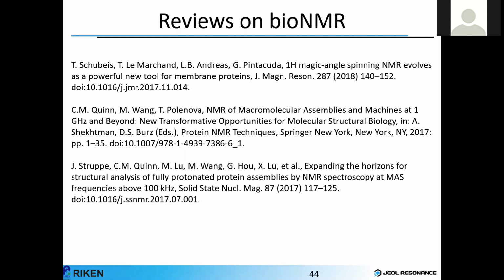And already when you get to 80% of the speed of sound, you start getting shock waves, and these are unpredictable shock waves. So if you convert your angular frequencies into linear velocities, what you find is that most of these fast spinning rotors are at about 250 to 260. I think the one from Agilent is about 267 meters per second.